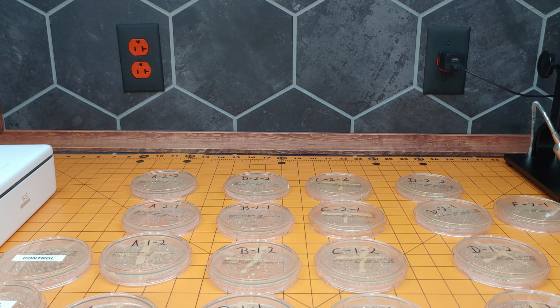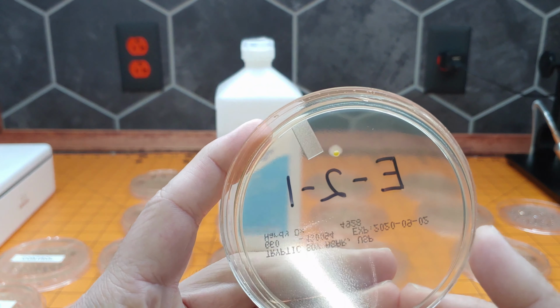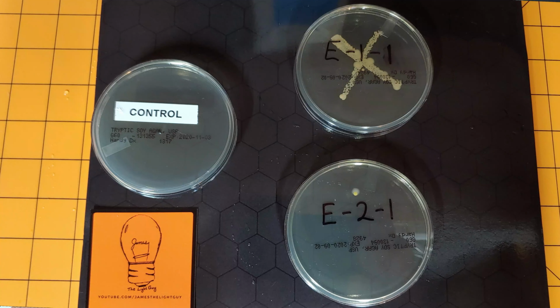Lastly, our sterilization method E, isopropyl alcohol, 70%. As we saw, pre-sterilization was pretty grody, and after a 1-second swab, well, not ideal. Looks like we managed to get a single little growth culture going. So once again, I would give this an 85% score. Again, a higher percentage isopropyl would have done a much better job, or just leaving the surface wet with the isopropyl for longer than the 1-second wipe may have also done a better job. But in this particular experiment, with what we did and how long we used, it wasn't perfect.